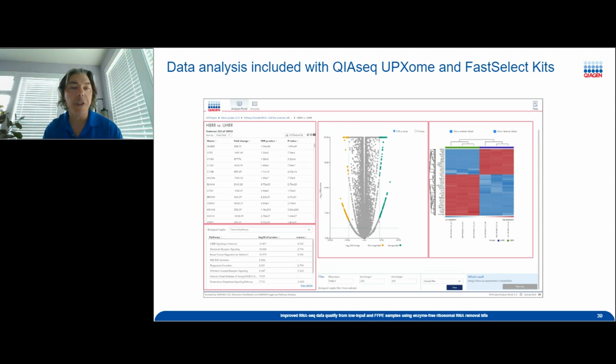And what I'm showing you here on this dashboard in the upper left-hand corner is the genes and their fold change values, and also the different statistics that we use. We use both the false discovery rate or the corrected p-value, and then also the uncorrected p-value here. I often use the FDR p-value, but there are some instances where you want to use the student's t-test p-value.